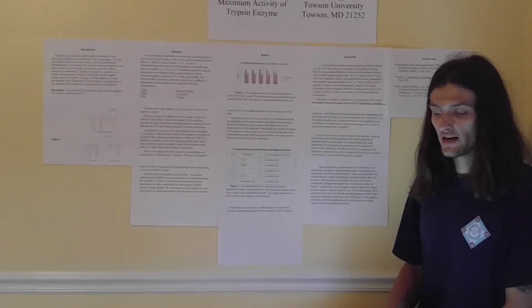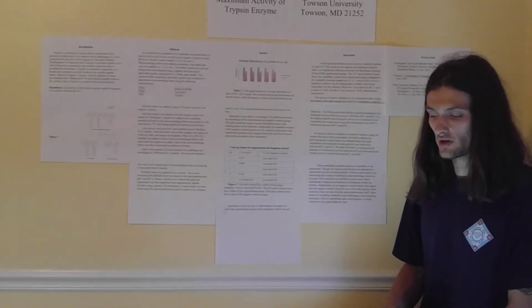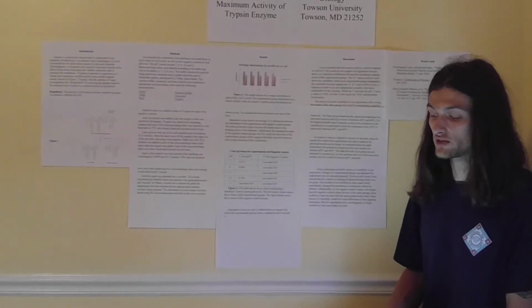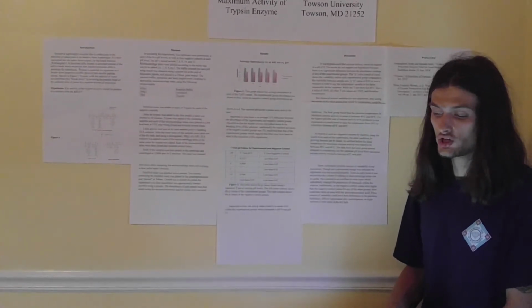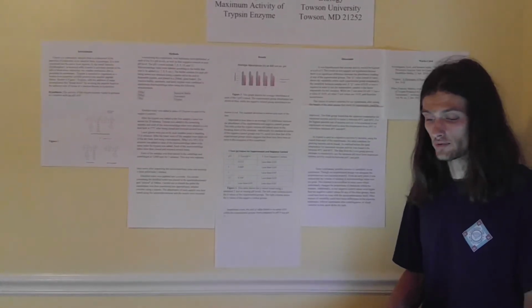It was hypothesized that enzyme activity would be highest at a pH of 9. The results do not support our hypothesis because there is no significant difference between the absorbance reading of any of the experimental groups. The p-value, the result of the t-test, shows the variability within each experimental group compared to the variability between the sample sets.